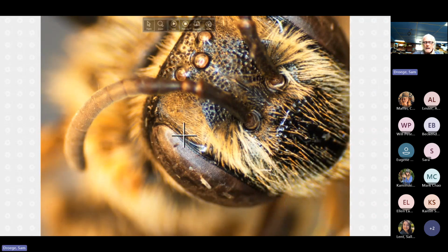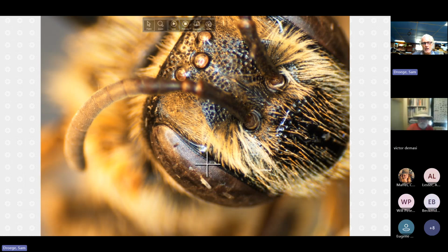So anyway, the issue here is just the shape of the fovea. We have very wide to very narrow, so that greater than 3 times difference. We have a very straight fovea below, not bent or curved, moderate distance from the rim of the eye, and very crisp in its portrayal. So those are the primary features of this species.